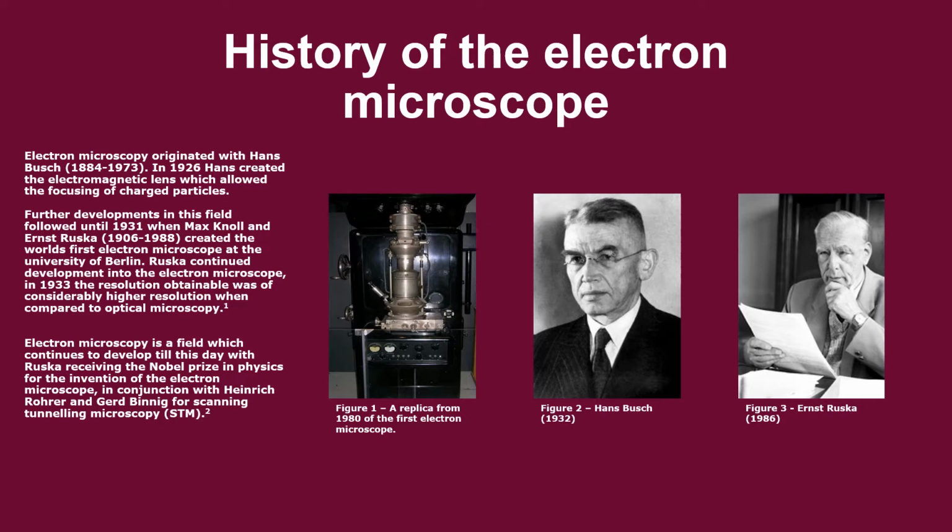to light microscopes. Electron microscopy is a field which continues to develop to this day, with Ruska receiving the Nobel Prize in Physics for the invention of the electron microscope, in conjunction with Heinrich Rohrer and Gerd Binnig for scanning tunneling microscopy. When something is too small to observe with the naked eye, we turn to microscopy.